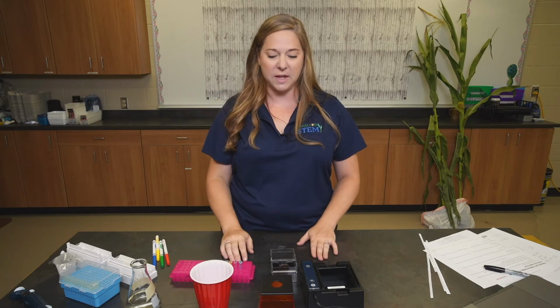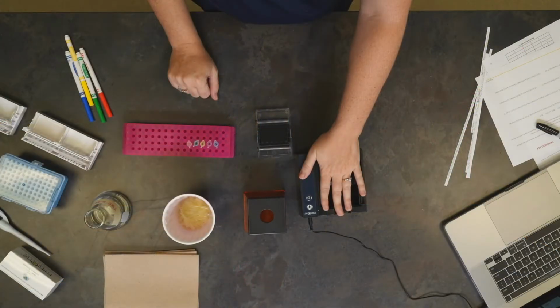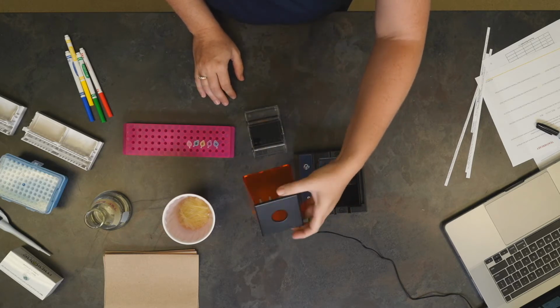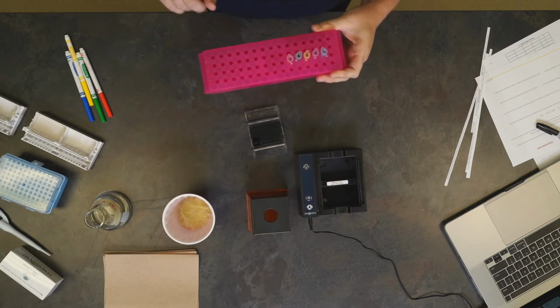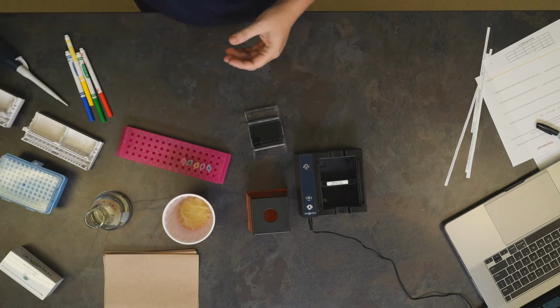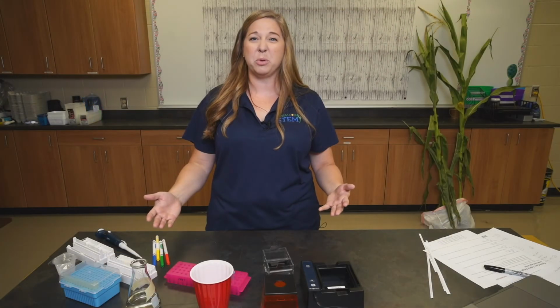But instead of having to go through all of the prep, it's very, very simple. The items that you will need come in the kit that you can check out from Kansas Corn. We have the MiniOne carriage, which is our power source. We have our tank for our electrophoresis gel. We have a viewer that allows us to illuminate the gel. You will get access to some microcentrifuge tube racks, an appropriate gauged micropipetter, and a gel form. All of this works together to make a pretty slick lab.